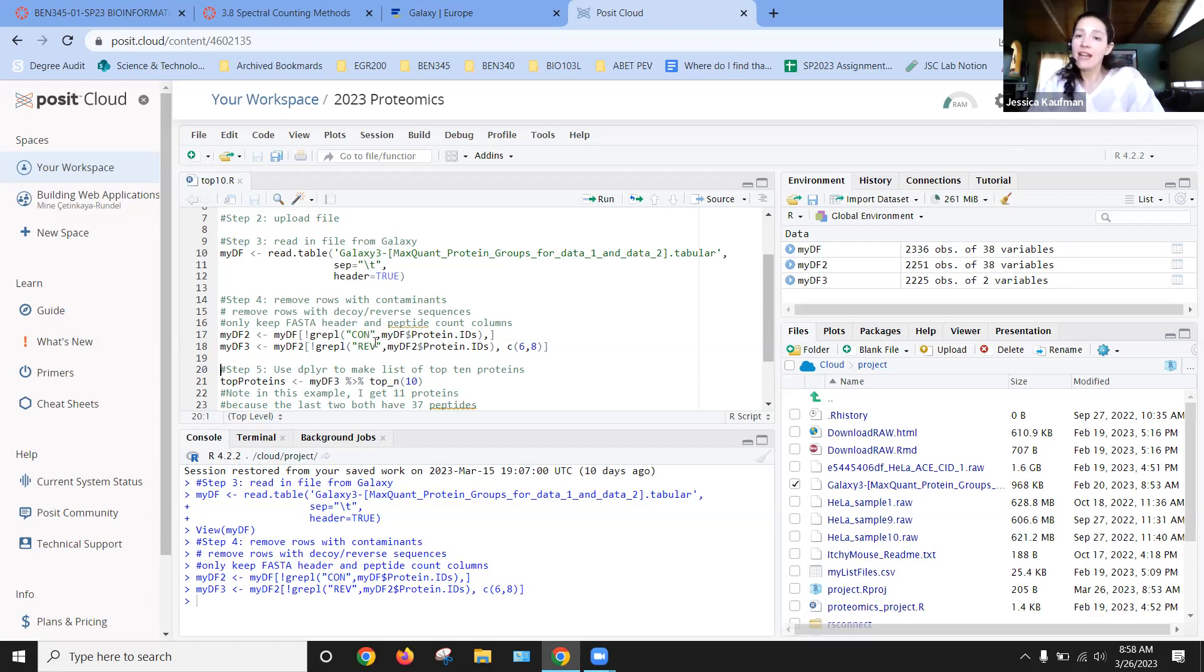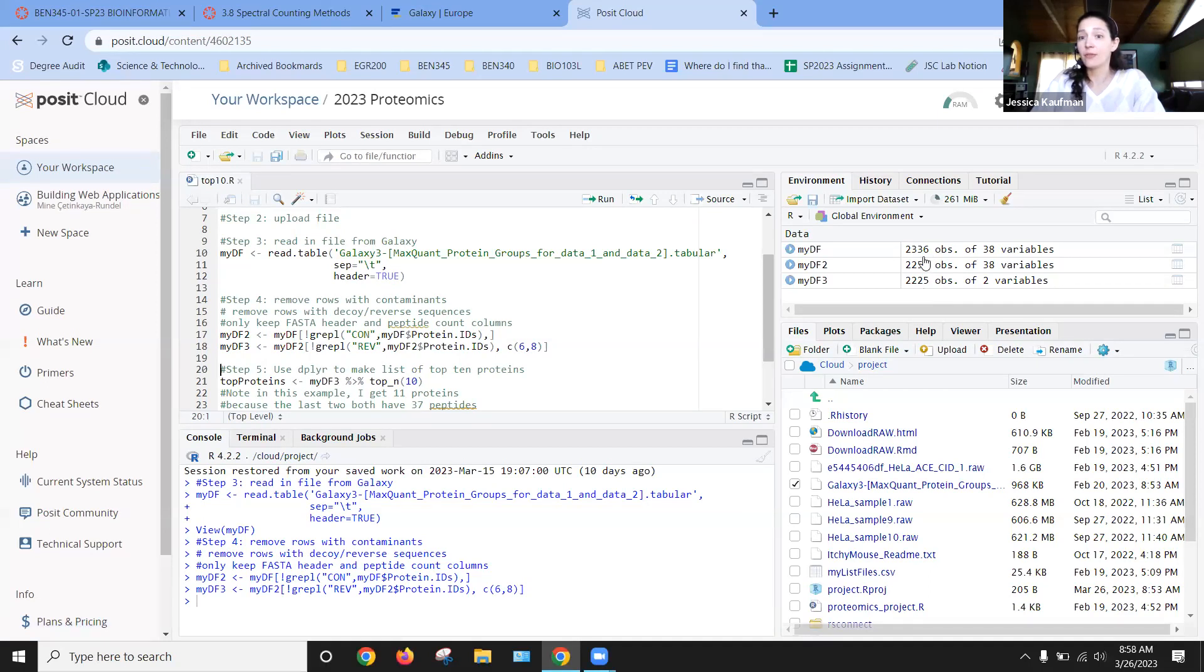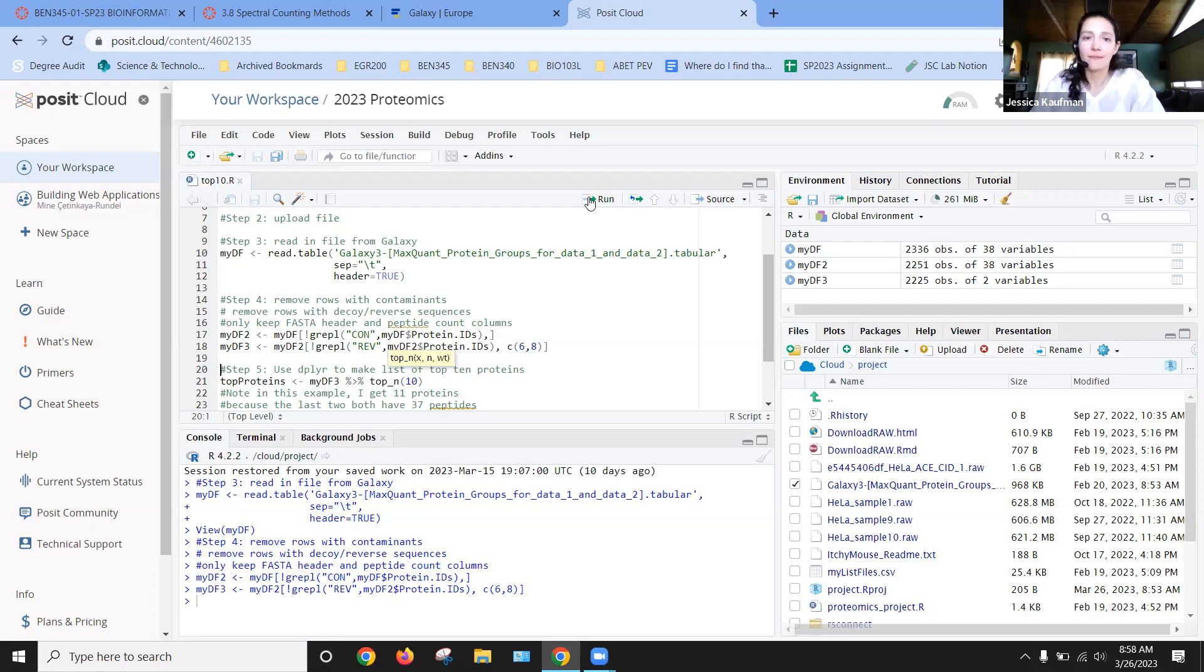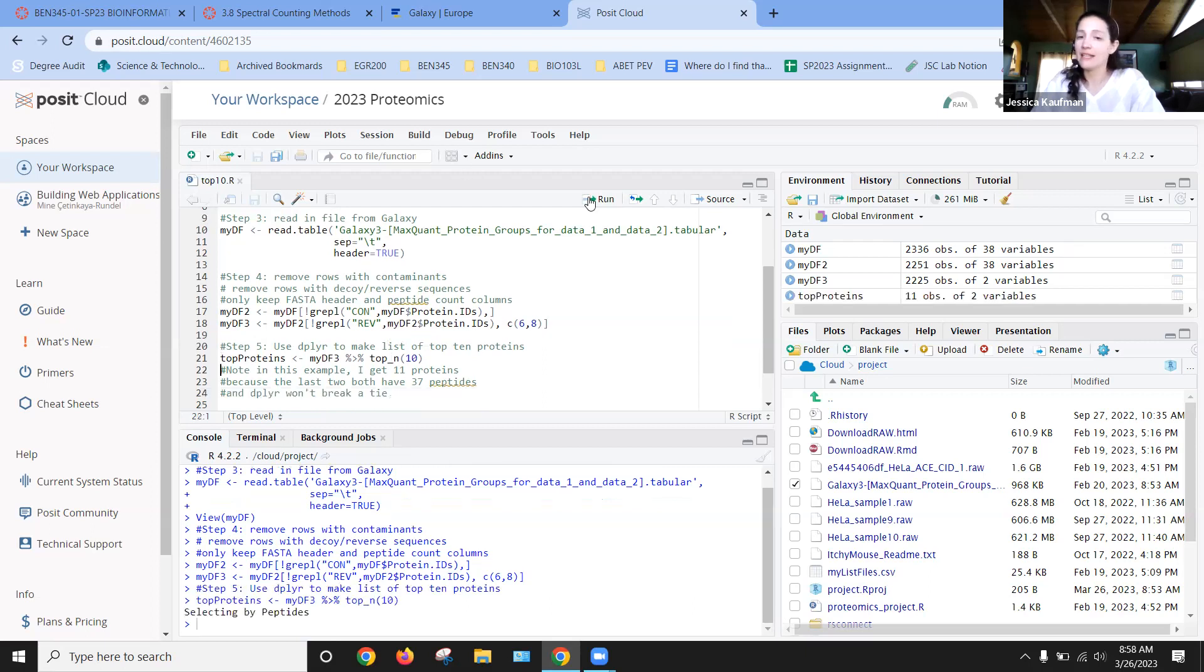So all of those REV codes are also things that aren't relevant to research. Now that I have a cleaned up list, and you can see it's smaller, right? It's only 2,225 as opposed to 2,336.